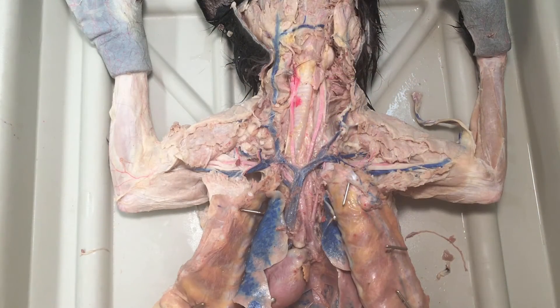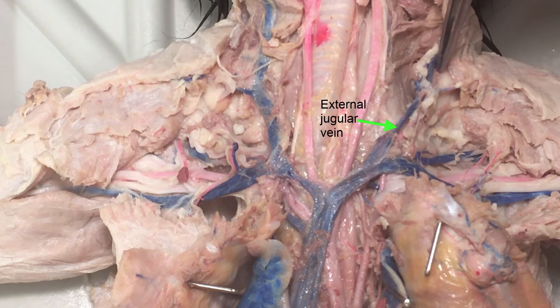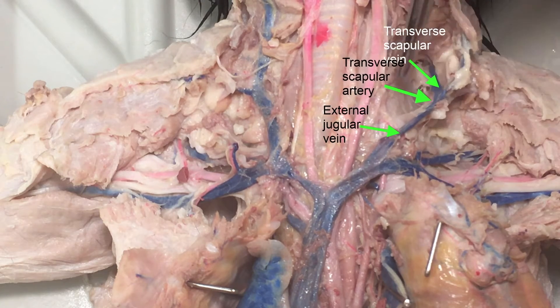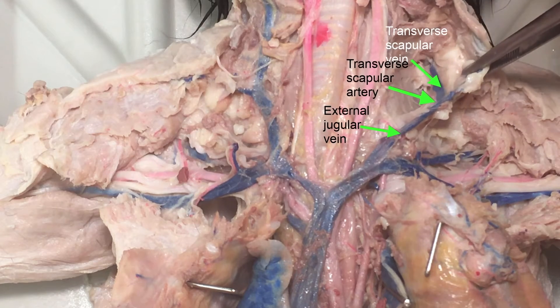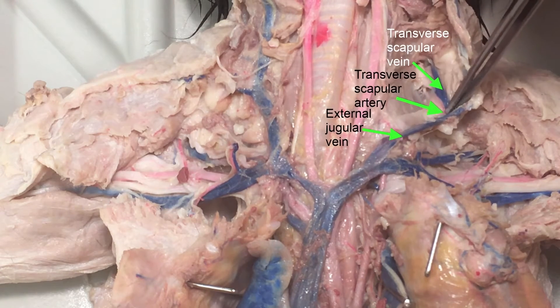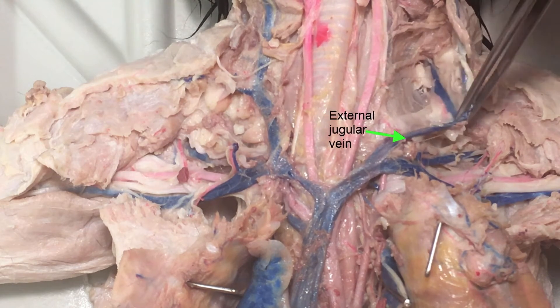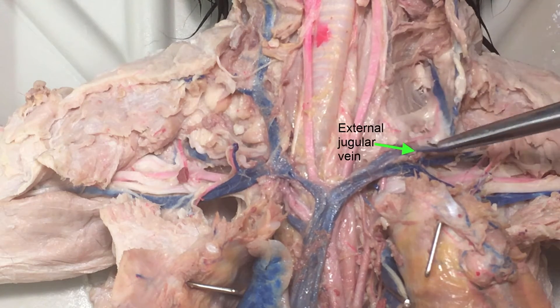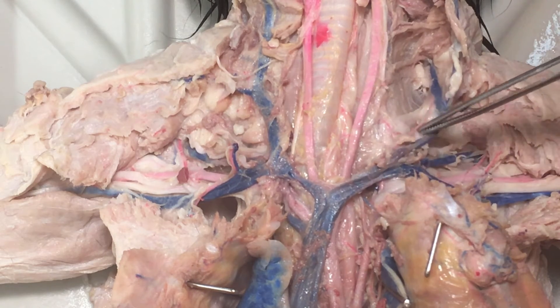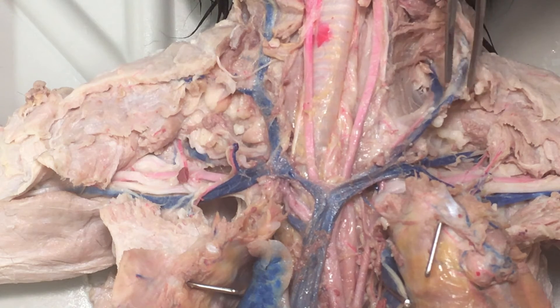Here I want to show you the transverse scapular vein. We've got the external jugular going up, but if you look behind that you should see this vein that's branching downward. You can also see that there's an artery associated with it as well — those are each the transverse scapular vein and artery. You can trace the artery back. The transverse scapular vein branches differently in that it's coming off of the external jugular.